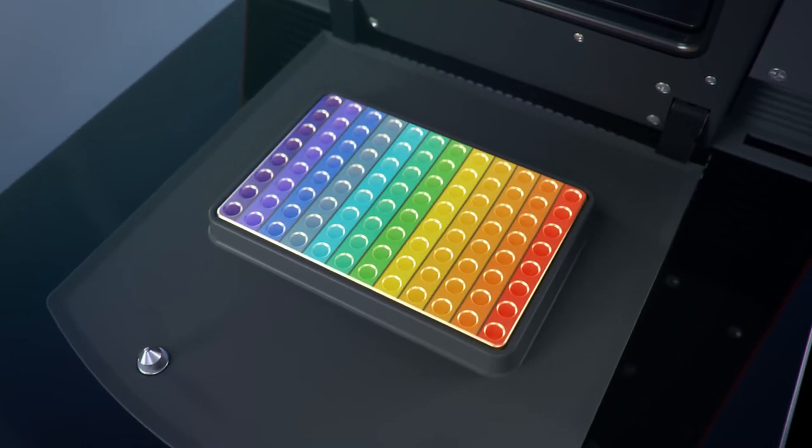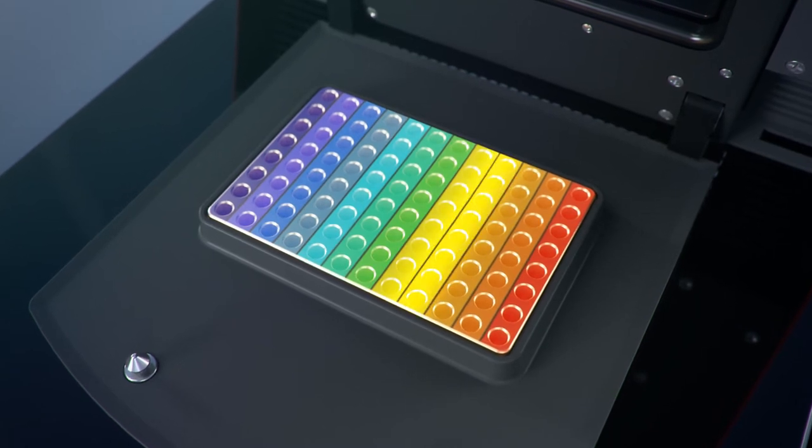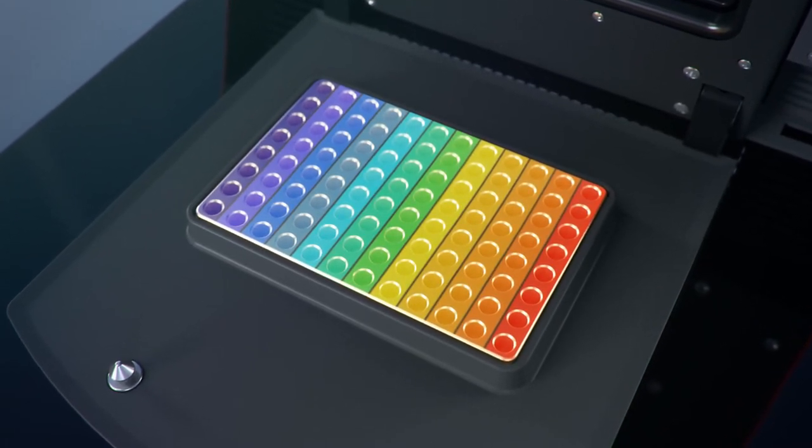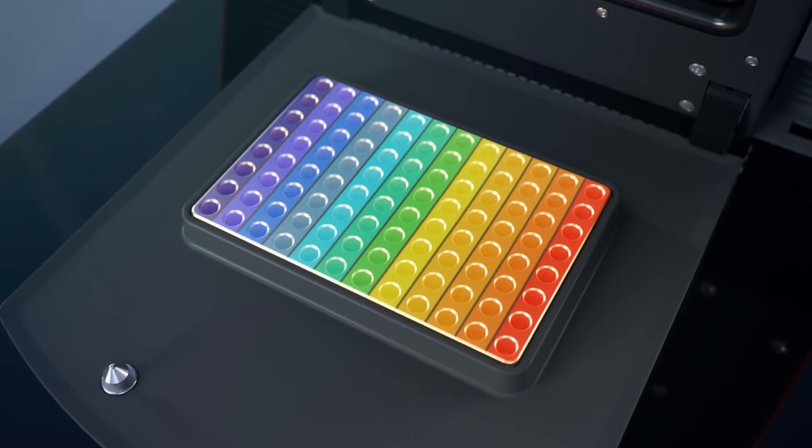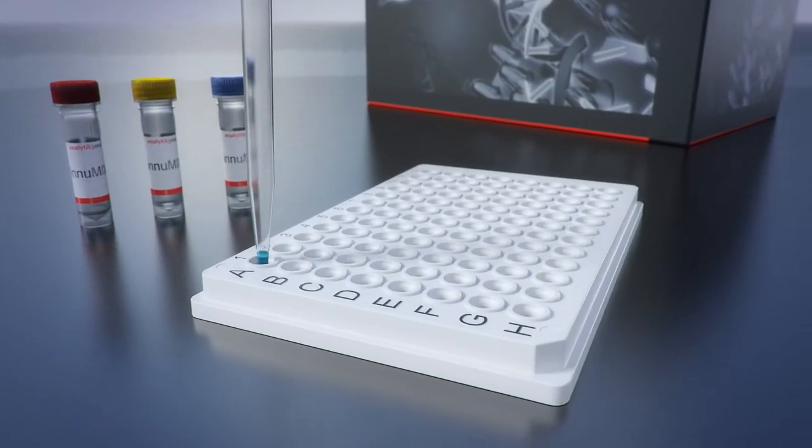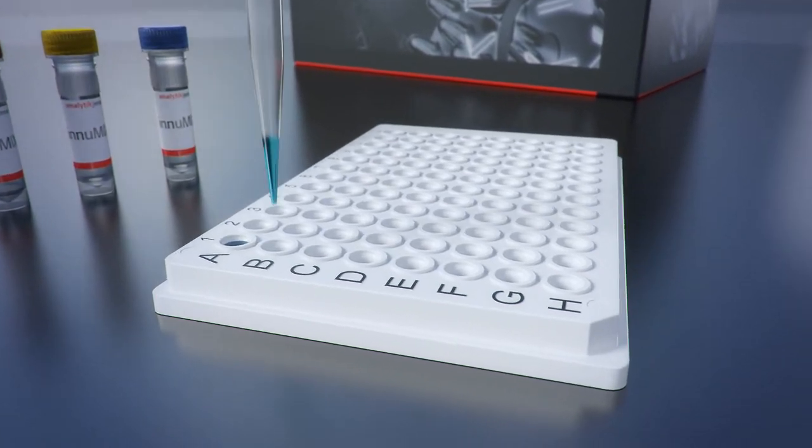With the linear gradient tool, users can enter integer temperature levels across 12 columns in a range of up to 40 degrees Celsius, eliminating guesswork for gradient applications in order to achieve optimal real-time PCR amplifications.